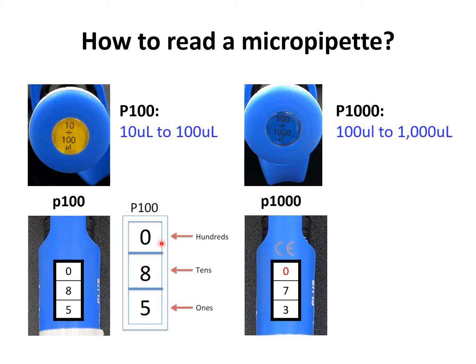If this is the hundreds, this is my tens, and this is my ones, that means that what I'm seeing right here is 85 microliters.